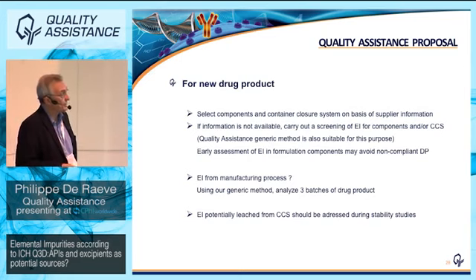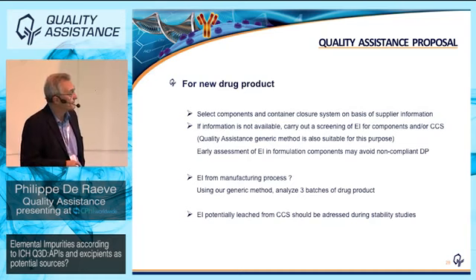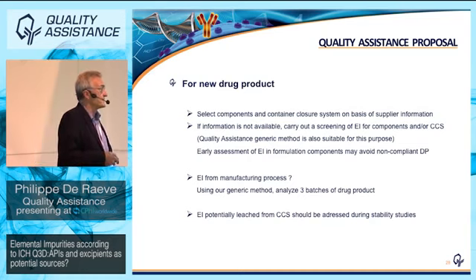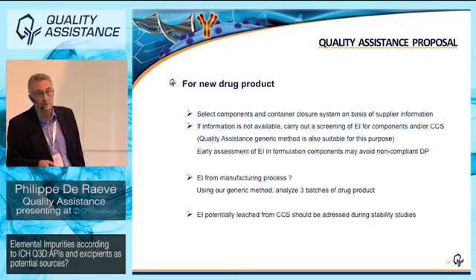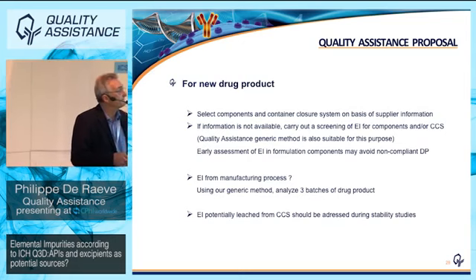And what about elemental impurities from the manufacturing process? Then, once again, the only way to be sure is to analyze some batches of the drug product. And for the elemental impurities potentially leached from the container closure, it will be addressed during the stability studies.